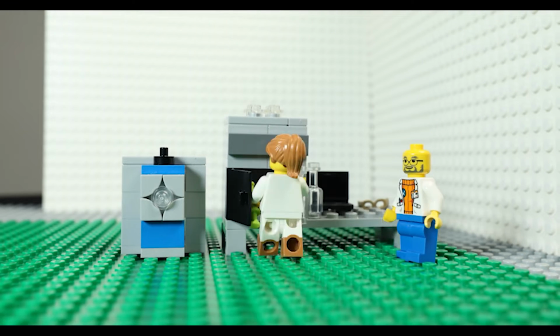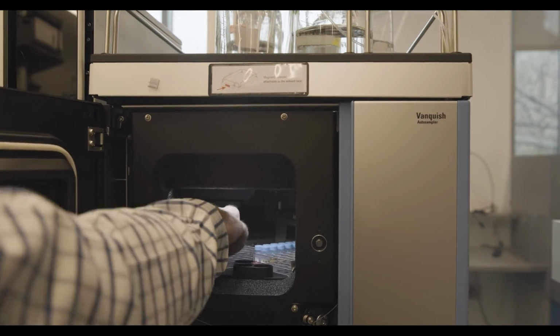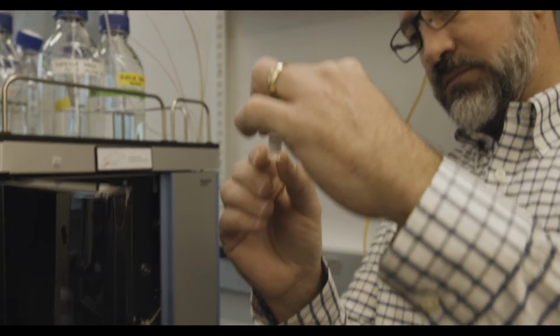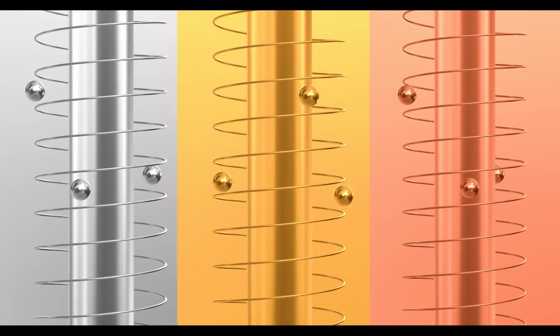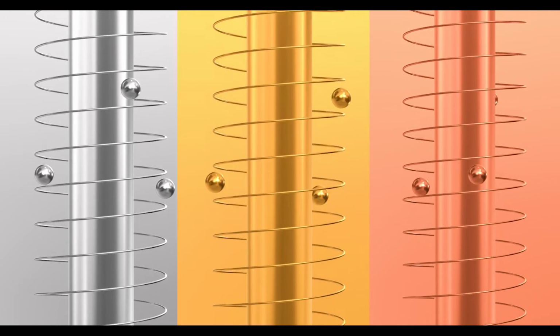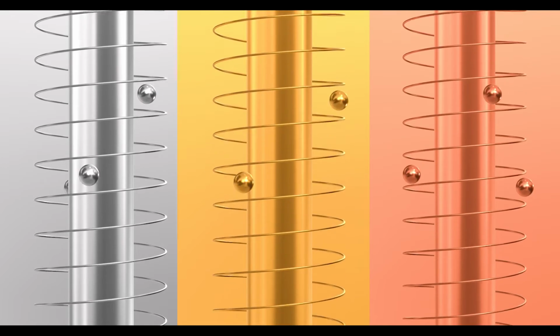In the mass spectrometer, we impart a charge to the molecules, making them ions. This gives us the ability to manipulate those charged particles, the ions, using electromagnetic fields in a vacuum. Once the ions reach the mass analyzer within the mass spectrometer, a very high voltage electrode causes those ions to spin rapidly around a central electrode. The faster they spin, the smaller the mass. We analyze the frequencies of those spins to give us those masses.